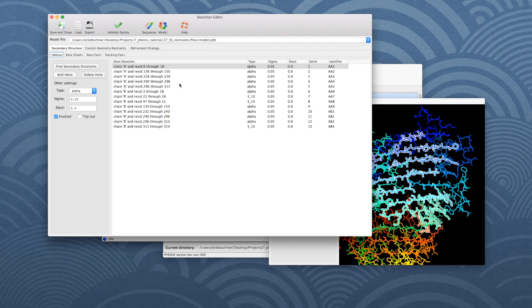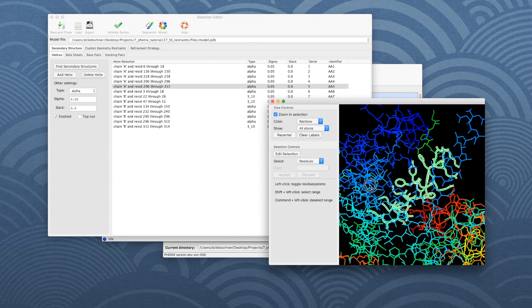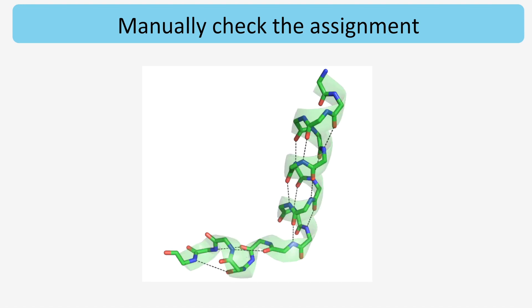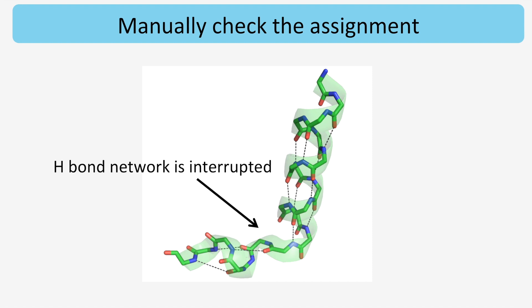For example, let's look at this helix, which is in chain A and runs from residue 296 to 315. This is how this helix looks like in isolation. There's a clear bend in the helix. When we draw the H bonds between peptide units, it can be clearly seen that the network is interrupted. The restraints algorithm has some safeguards to prevent that — for example, this oxygen atom and this nitrogen atom being considered bonded. However, it is preferable to supply the correct annotation, so please check your annotations manually in a molecular viewer.